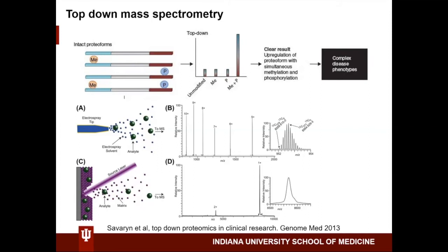Absolutely. Yeah, that's a really good point. I had a whole project of that, where ironically, the covalent modifier the chemistry lab had synthesized wasn't actually a covalent modifier. It completely changed the structure of the enzyme. But we learned that through top-down mass spec. And another really important application might be looking at different splicing isoforms, where it might be really difficult to look at those through bottom-up or to quantify those through bottom-up mass spec.